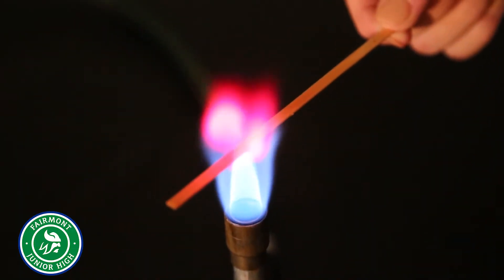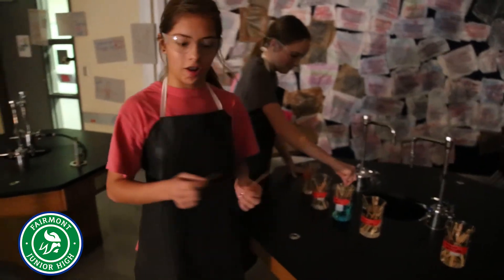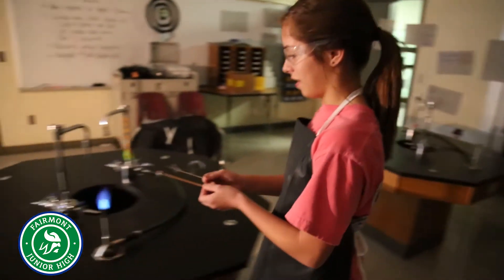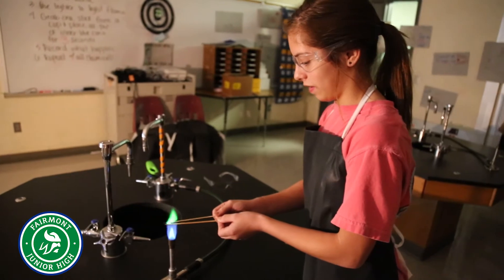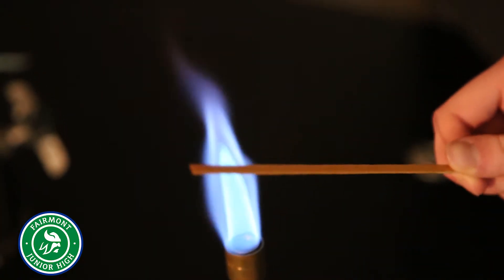In this class, we're getting them ready for chemistry in high school. The main purpose is to let them experience awesome experiments and understand the basics of how matter works, which is what chemistry is—how matter works.